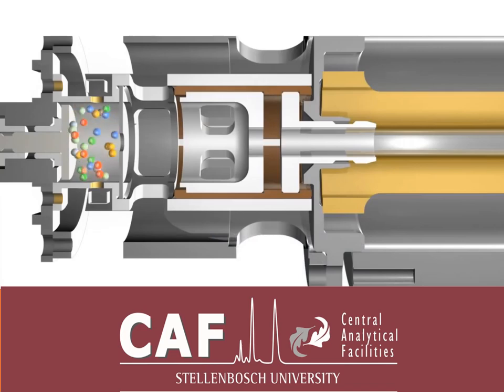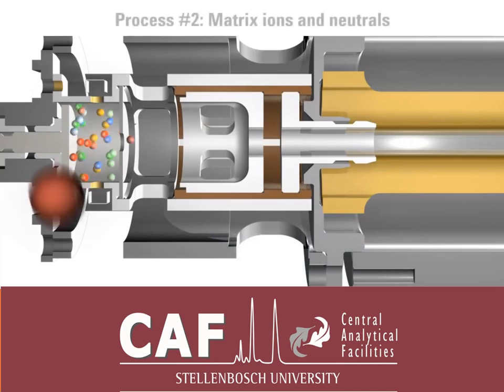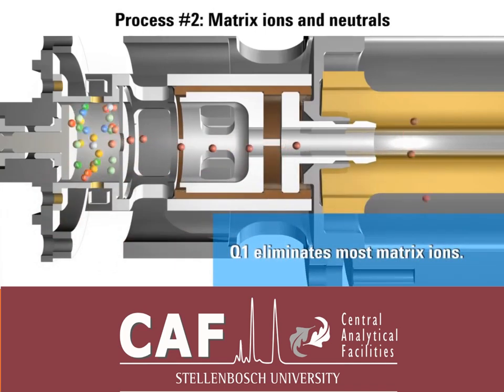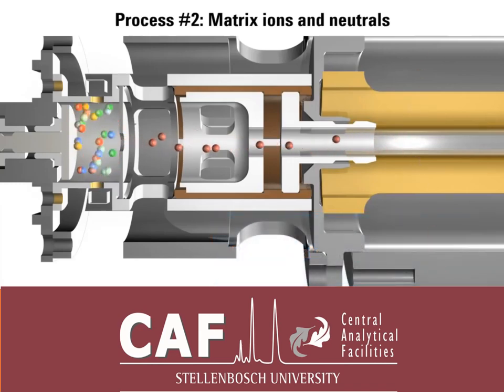Parallel processes are occurring simultaneously for the molecules from the sample matrix and instrument background like column bleed. The quadrupole analyzer performs the critical task of mass filtering to isolate the analyte's ions from the majority of these ions. Chemical noise often remains after the first quadrupole, but the selectivity of MSMS removes this final source of interference.